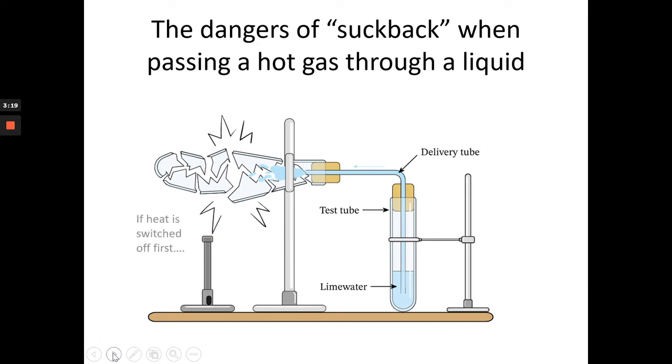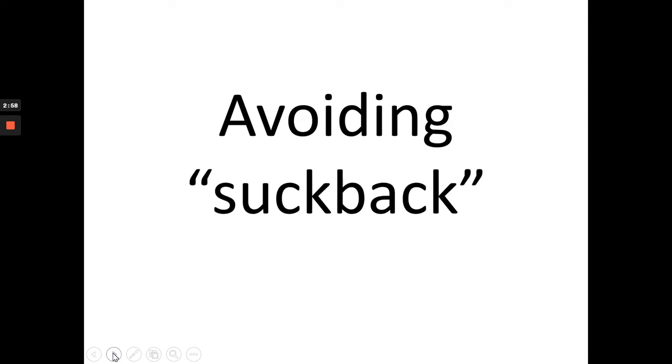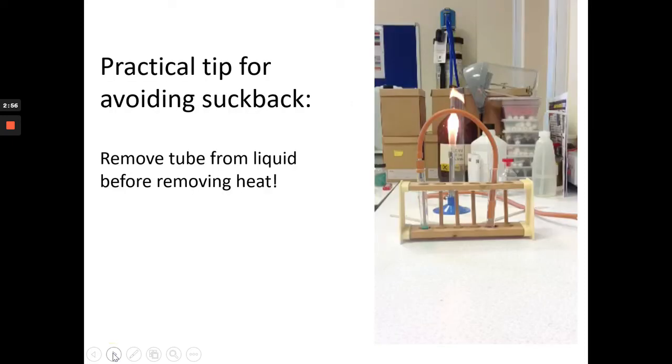Suckback is when the heat is switched off first, creating a partial vacuum inside the test tube because the air in the tube starts to cool and contracts in volume. That causes suction to pull the liquid up into the hot test tube, and cold liquid coming into contact with the hot test tube causes the glass to shatter. So to avoid that, I'm going to show you what technique we use.